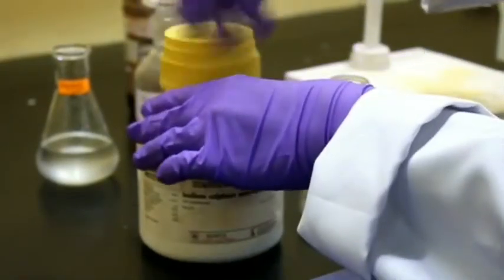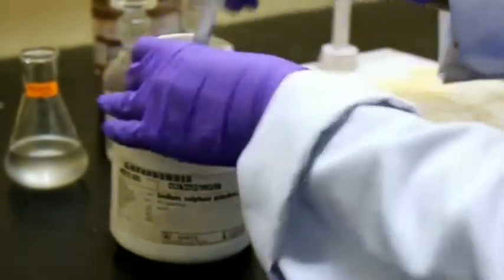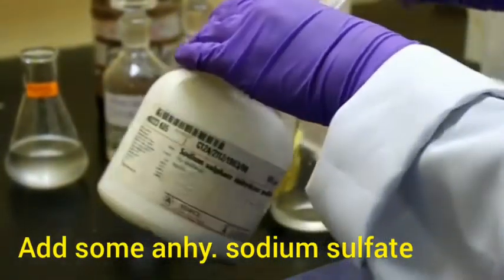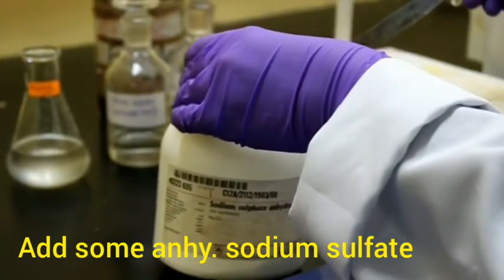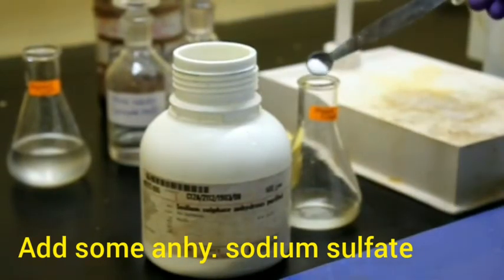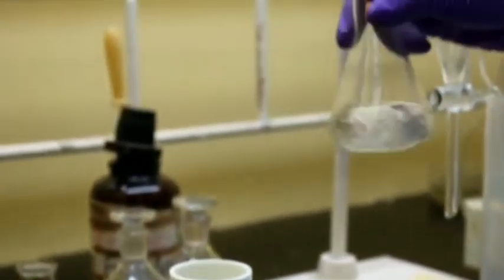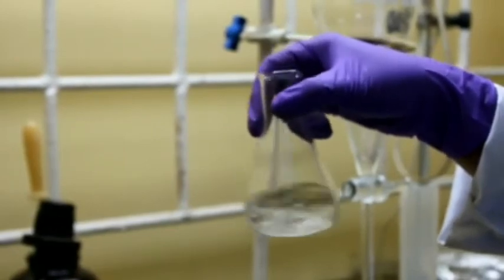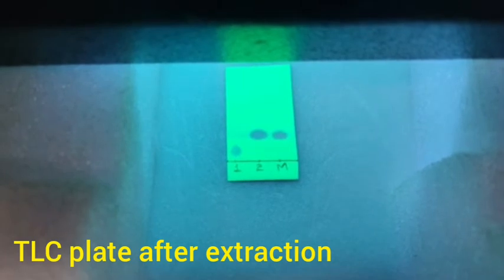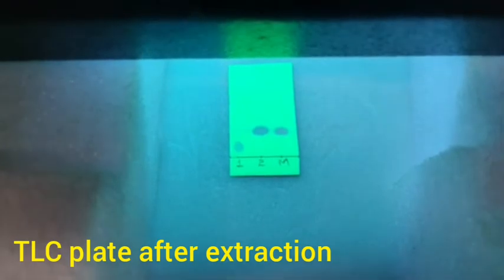Now we are adding anhydrous sodium sulfate to the organic solution. Anhydrous sodium sulfate is widely used as an inert drying agent for removing traces of water from organic solution. Wait for some time. This is the final TLC after workup, where we can see the starting material is completely consumed.